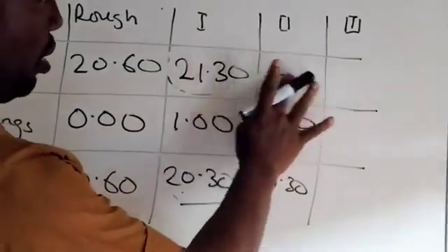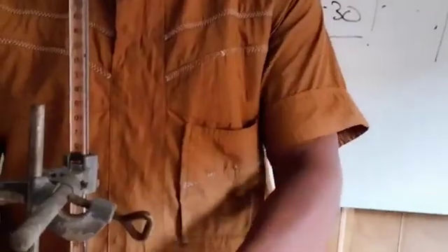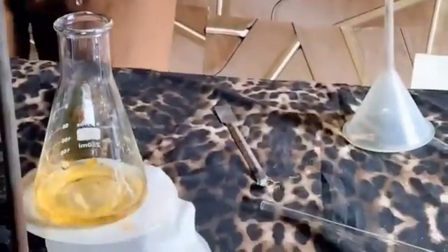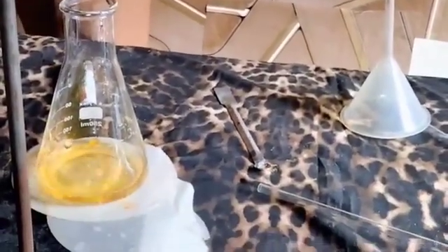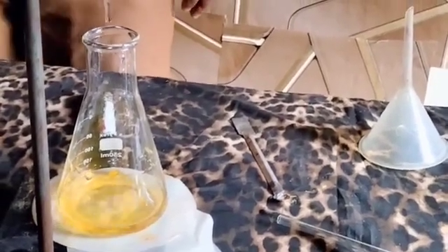So we clean up and then do the experiment again. So we started from 5 and it is going down. So we expect, as we said, to run it to around 25. So we can increase the pace a little and we'll be watching it. So when it's 25, we'll close the tap and then take it drop by drop and see where it's going to change as we expected.